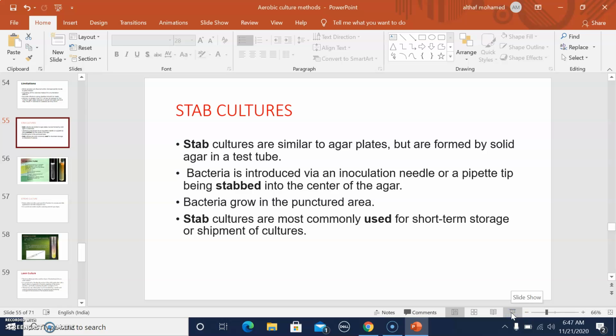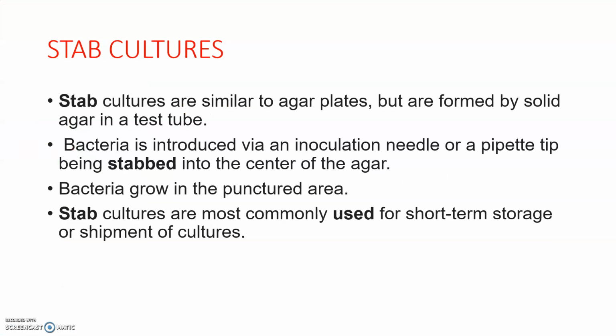Good morning all. Today we are going to discuss the rest of the aerobic culture methods, a few methods coming under aerobic culture. First one is stab cultures.